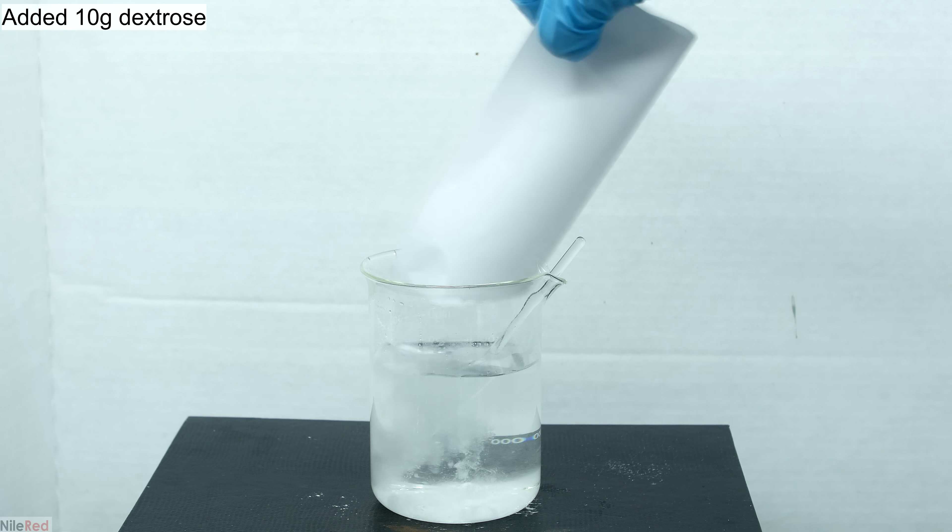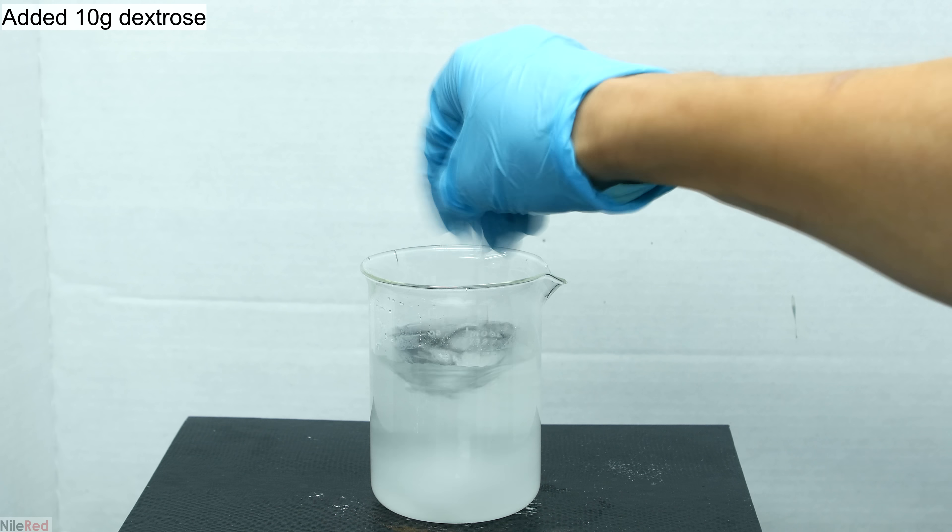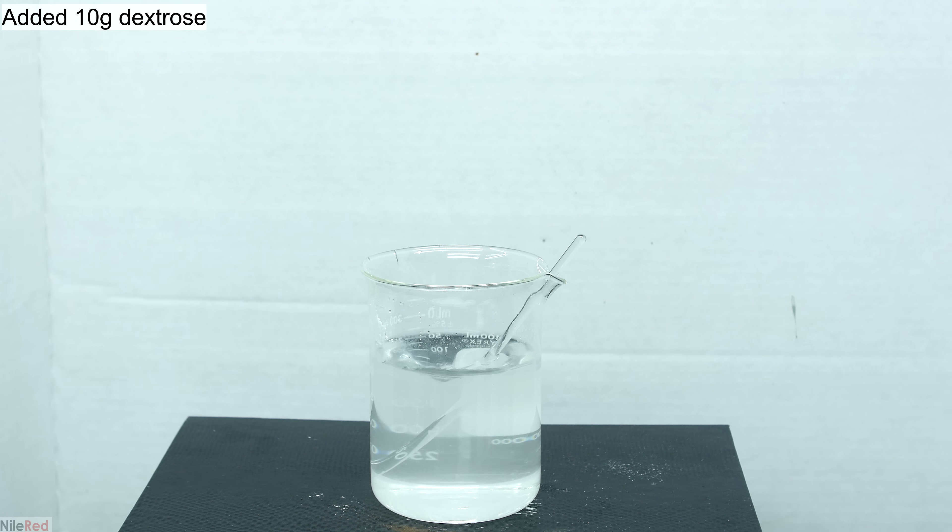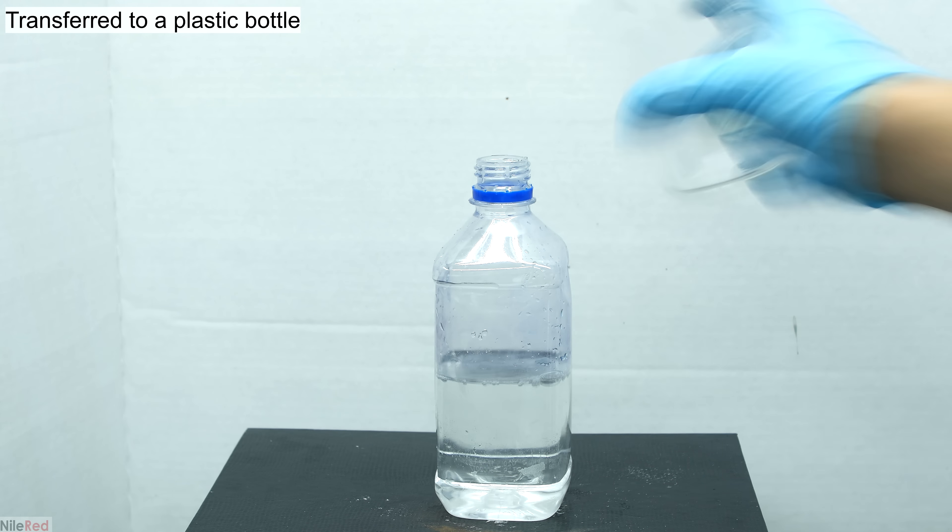Into the potassium hydroxide solution I then pour in about 10 grams of dextrose. Again we stir things until all of the dextrose has dissolved and then I take out the stir rod. The potassium hydroxide and dextrose solution is then poured into a water bottle.